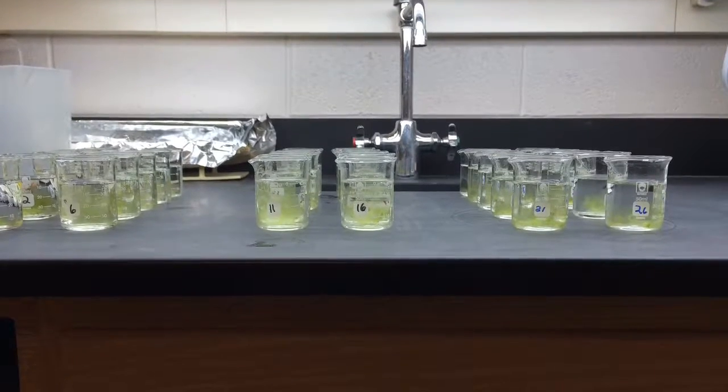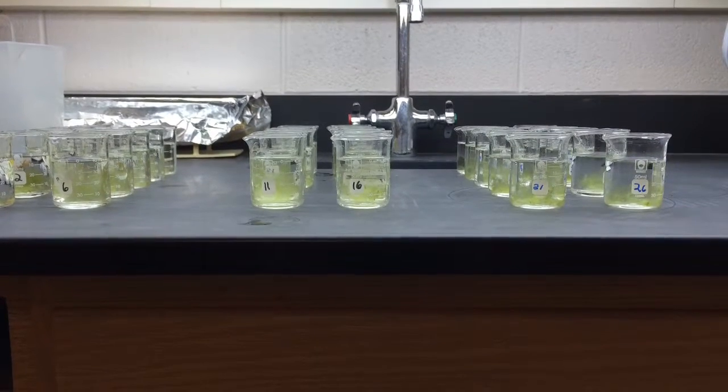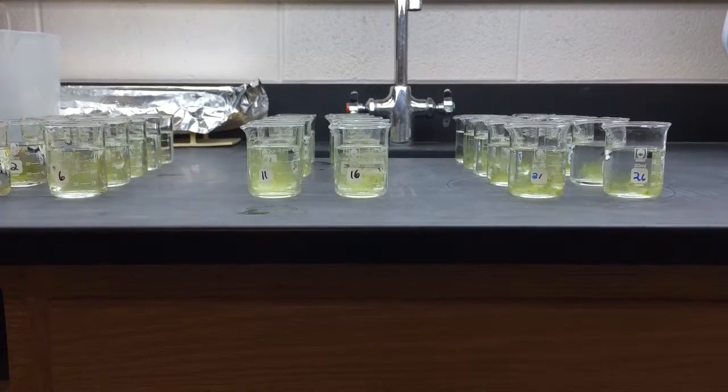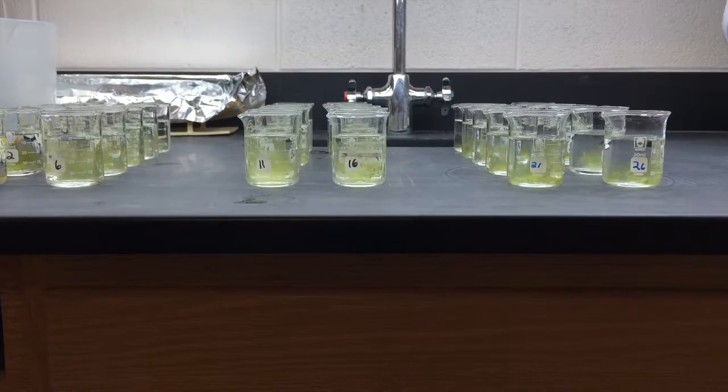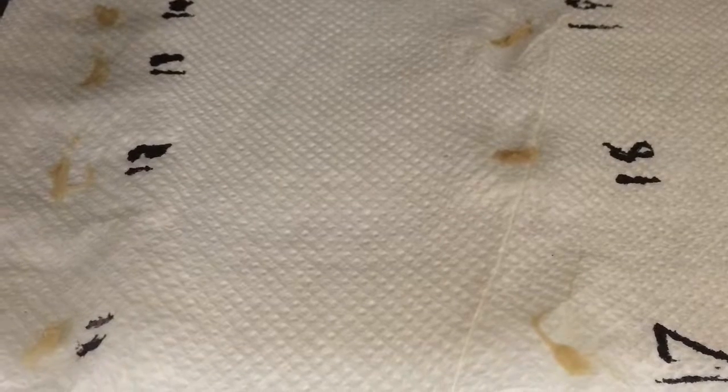The replicate beakers were then placed under a cool fluorescent light and left unsealed to promote growth over a 10-day period. Throughout the 10-day experimental period, observations of the algal growth were made every other day. On day 8 of the experiment, the algae was observed to be white in color with condensed filamentous structures, which appeared to be premature death.